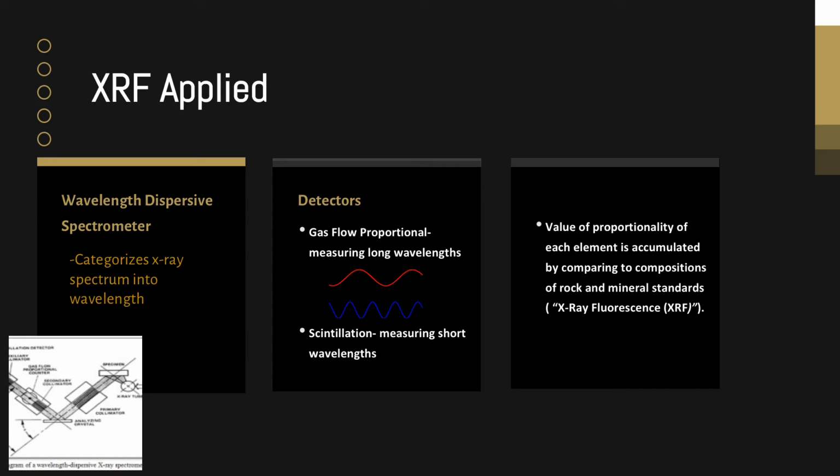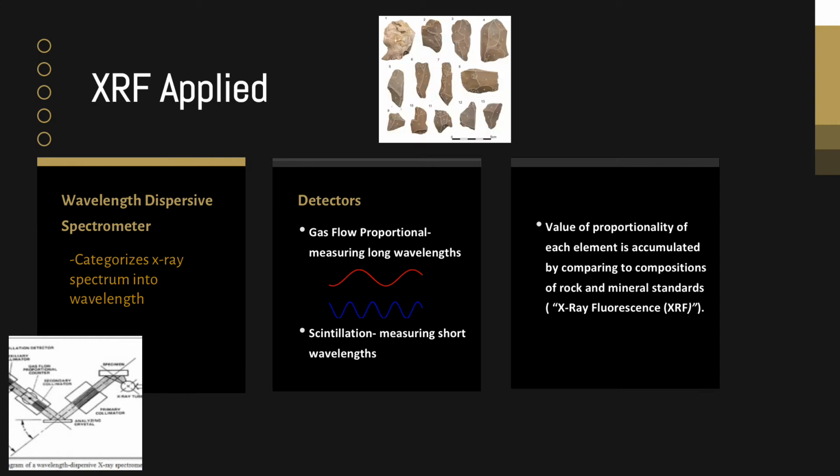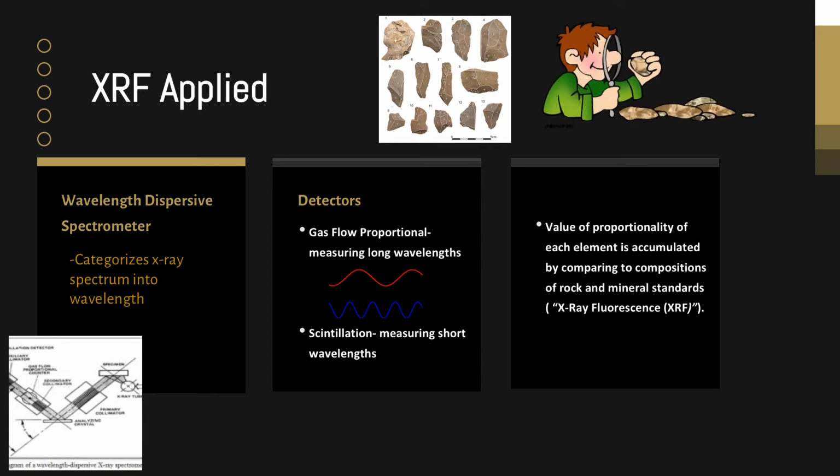The value of the proportionality of each element can be compared to the known composition of rock and mineral standards. Using this information, major and trace elements in geological materials can be easily analyzed.